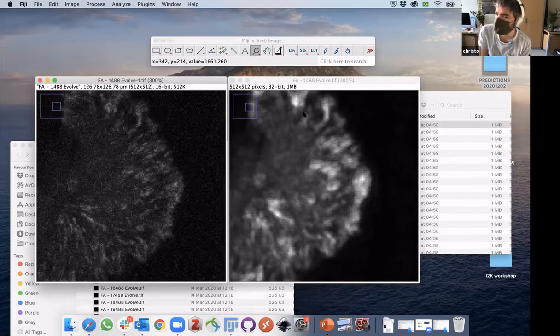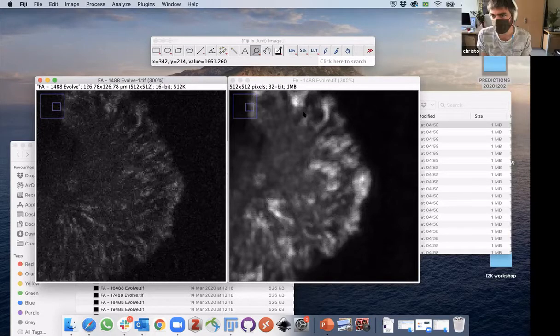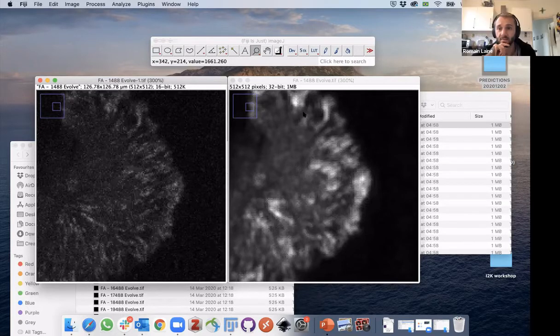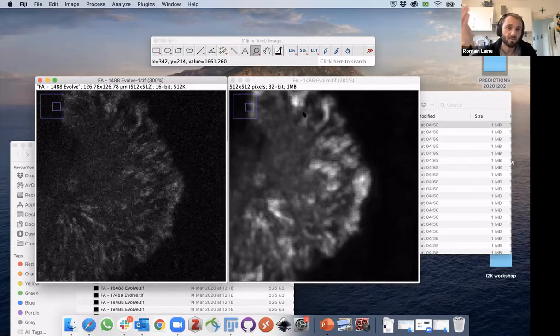I think in the manuscript it's stated that Noise2Void is not good at removing artifacts from scan images, and I guess that's because it's not a random pixel-to-pixel noise, right? Yeah, exactly. It's a structuration of the background based on the structures that are there. So in the case of slight patterns in the background, Noise2Void will think it's structure and it'll denoise those structures.